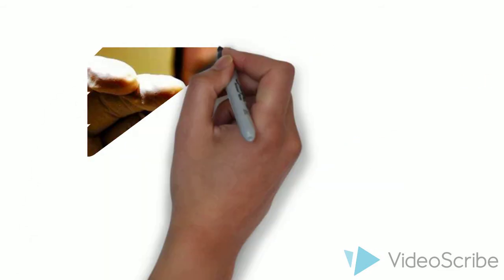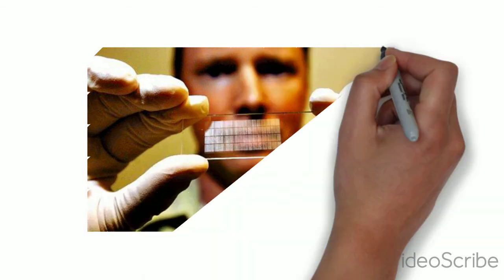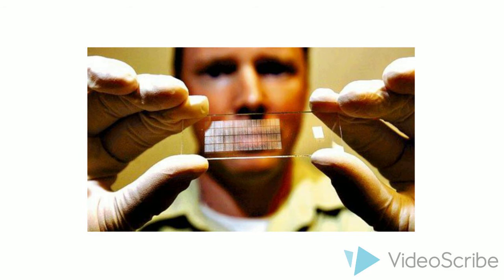To create a microarray, thousands of short single-stranded DNA sequences were synthesized in defined positions on a glass plate. The synthesized DNAs represent portions of all exons from a genome of interest.